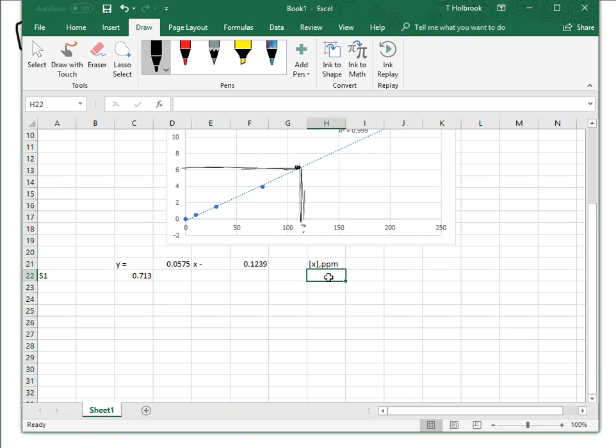To do that, Excel needs to understand that you want to do a calculation. So you're going to start off with the equal sign, right? That is the trigger. Oh, they want me to do a calc? Okay, I'm ready. Give me the numbers. Well, what happened here is that we took our absorbance, the Y, and we added the 0.1239, right?